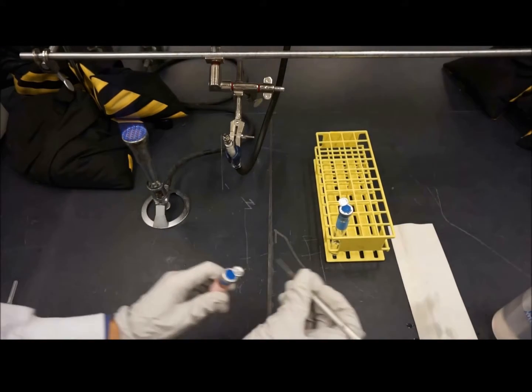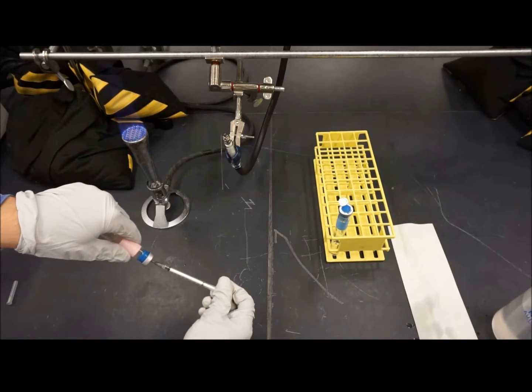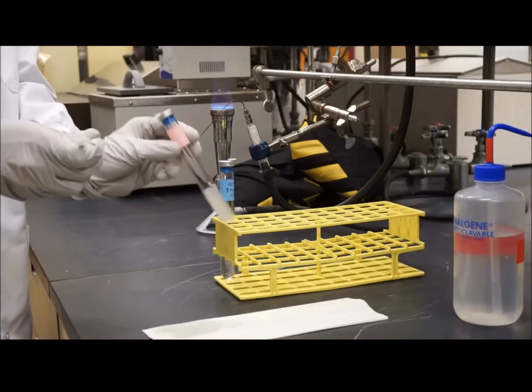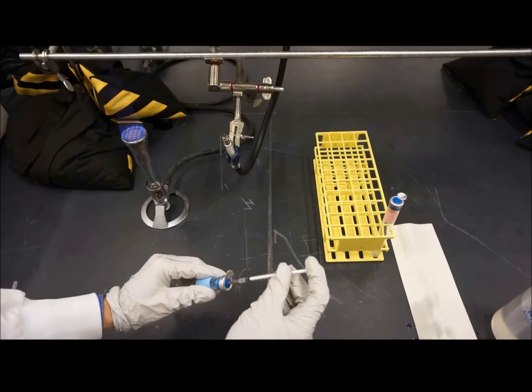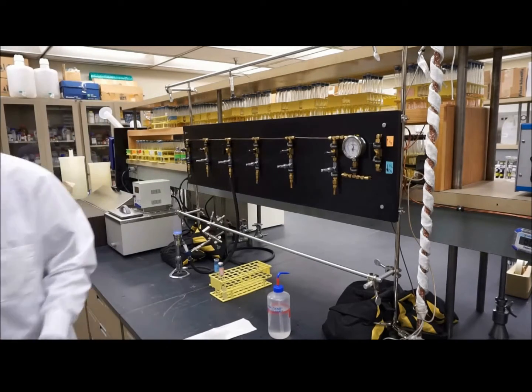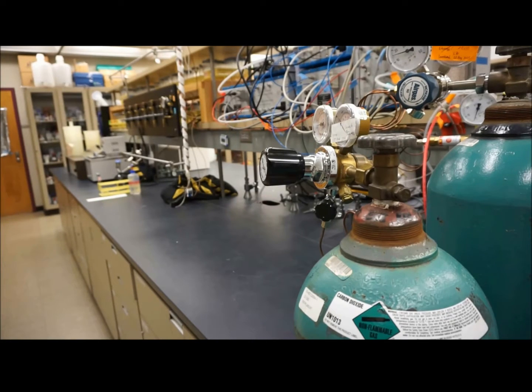We pierce the tube with the old culture, which has a pink label. We withdraw a small volume, about 0.1 milliliters. We take the tube of new media and inject the culture using the syringe. This completes the transfer. We will turn off the gassing station, incubate the tube in a 39-degree incubator overnight, or until the culture grows.